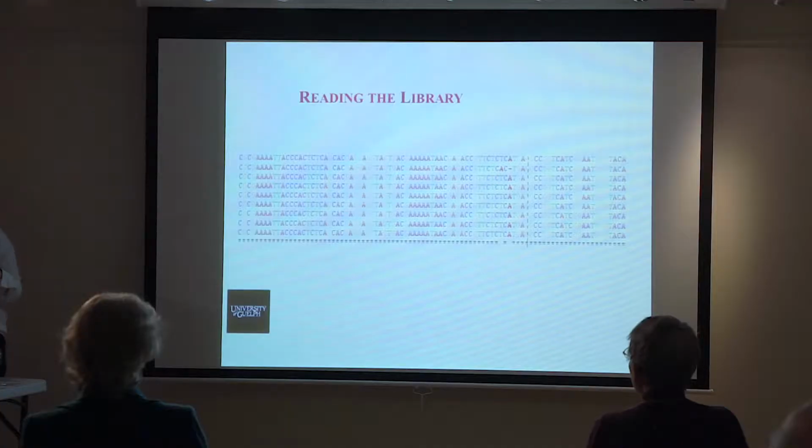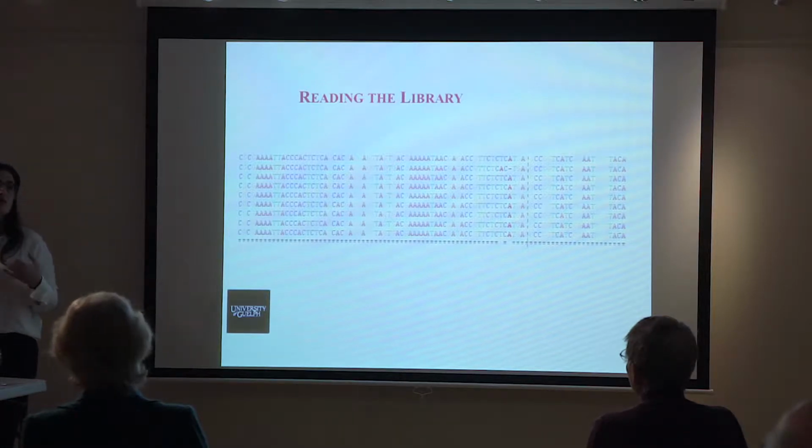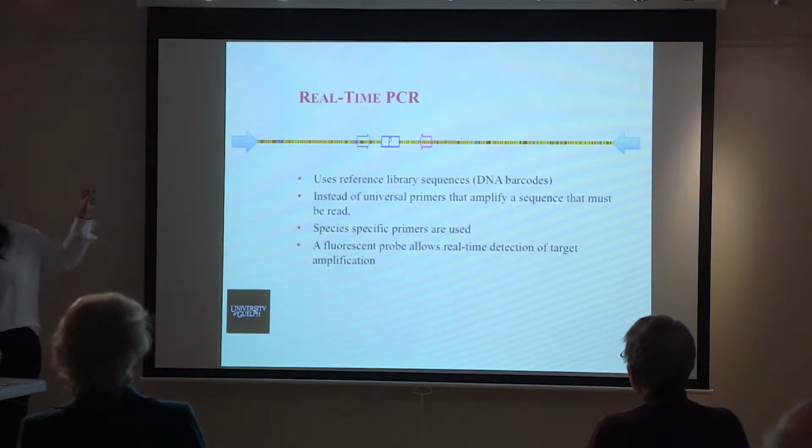Well, what we can do is make use of the amazing database that's been put together in BOLD and these vouchered sequences that we know come from expertly identified materials, and then use those sequences to compare that longer sequence and look for portions that are specific to a certain target. So instead of doing a Sanger sequencing method like DNA barcoding that's going to be looking for a larger sequence, we can focus in on a couple of key regions that tell a certain target apart from all of the other ones. So what I have here is the illustrative DNA barcode, so that full colorful thing of As, Ts, Gs, and Cs there.